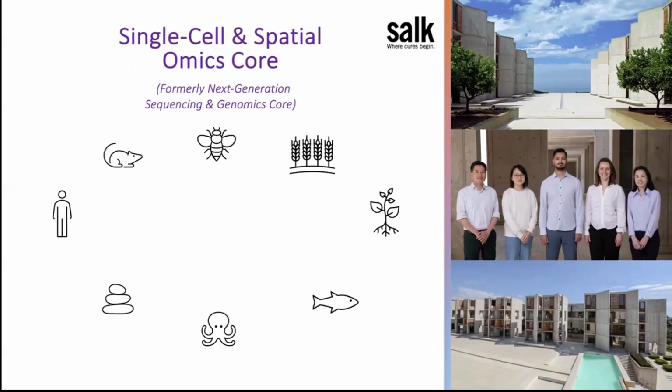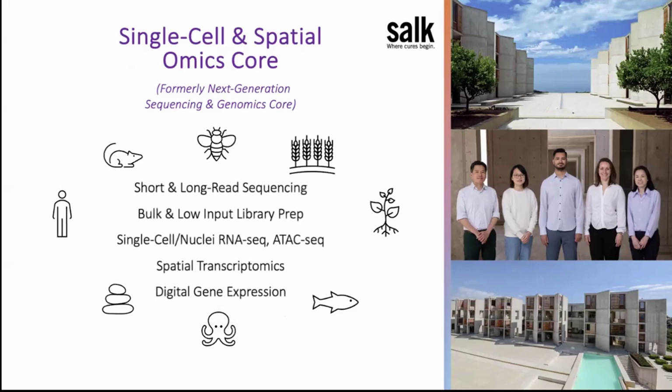What we currently offer here at the core: short and long-read sequencing, bulk and low-input library prep, single-cell and single-nuclei RNA-seq, ATAC-seq, spatial transcriptomics, of course, that I'm going to develop in a minute, and digital gene expression.